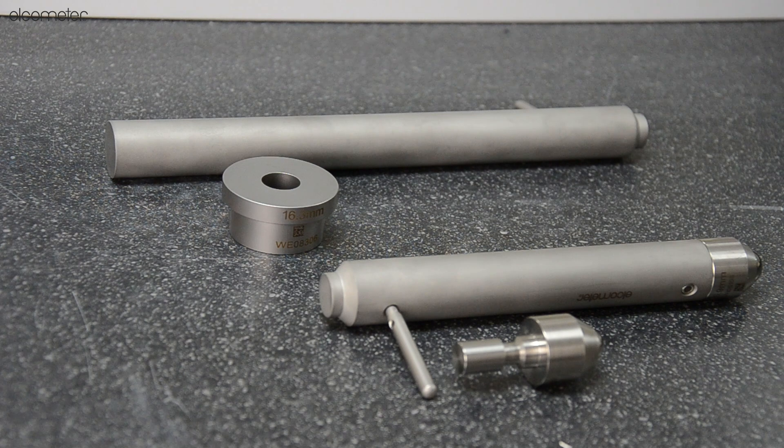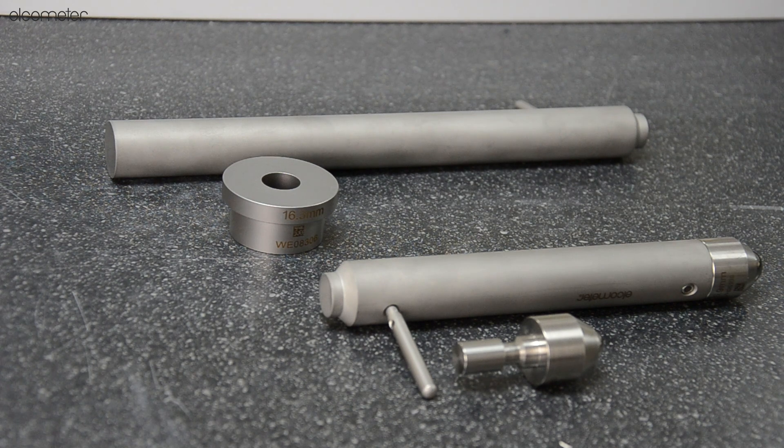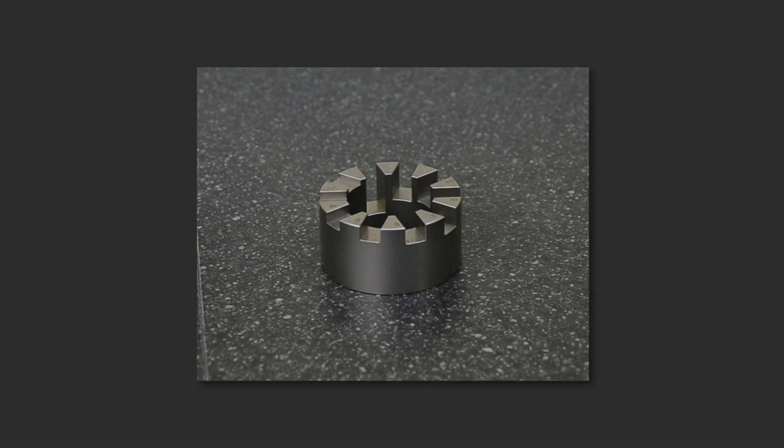Every kit is slightly different. Some contain, along with the other components previously mentioned, an adjustable stop collar to limit how far into the sample the punch or indenter travels, and a sample clamp.